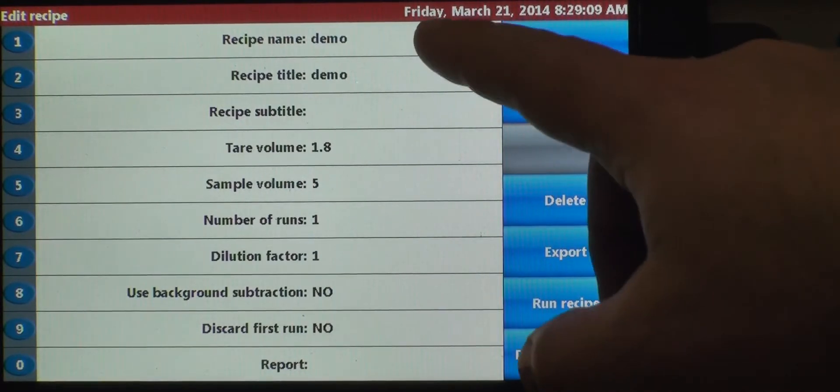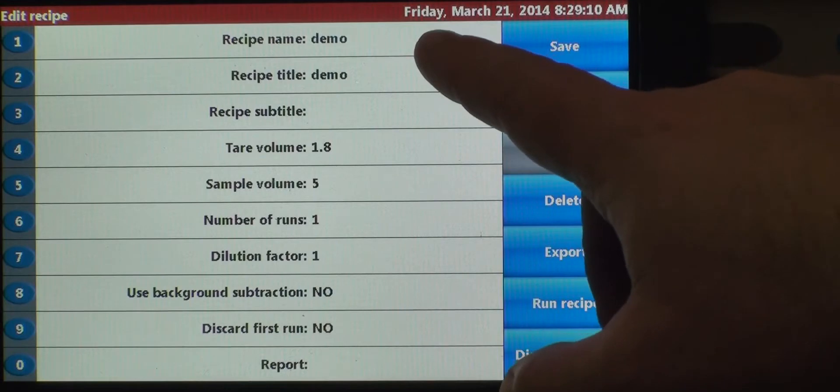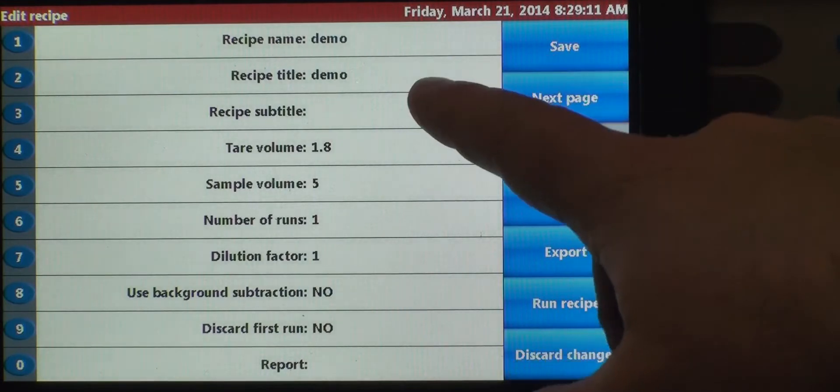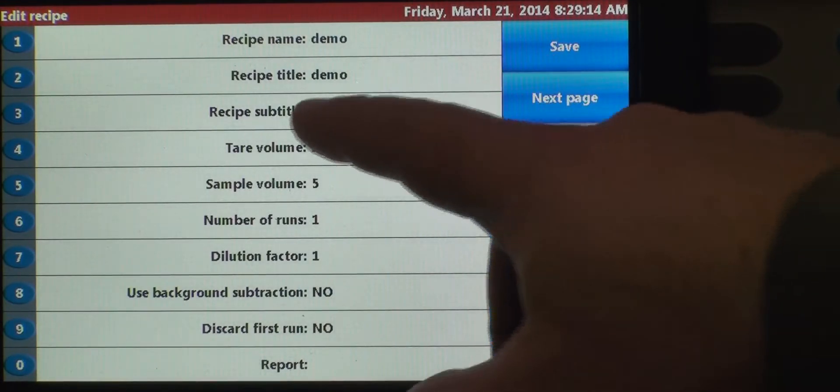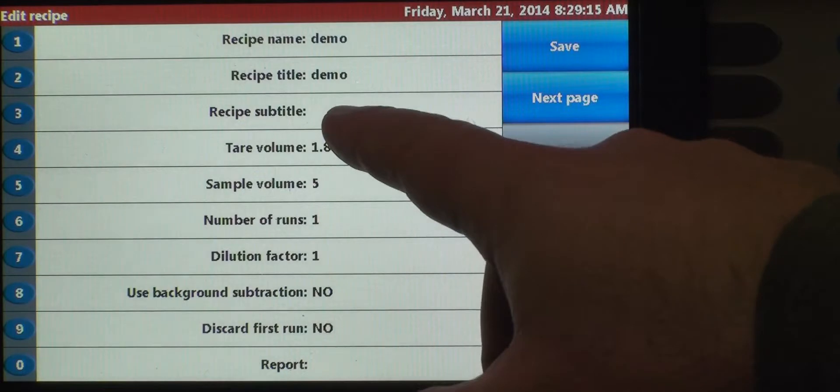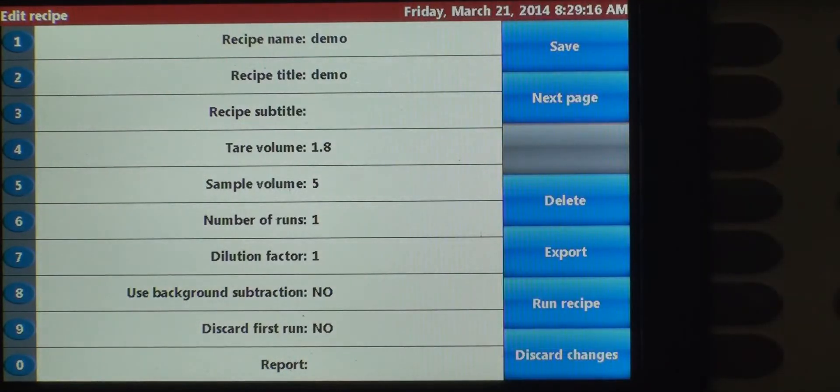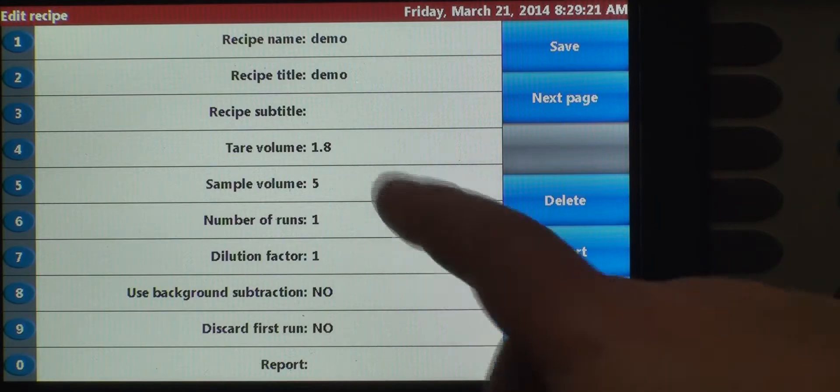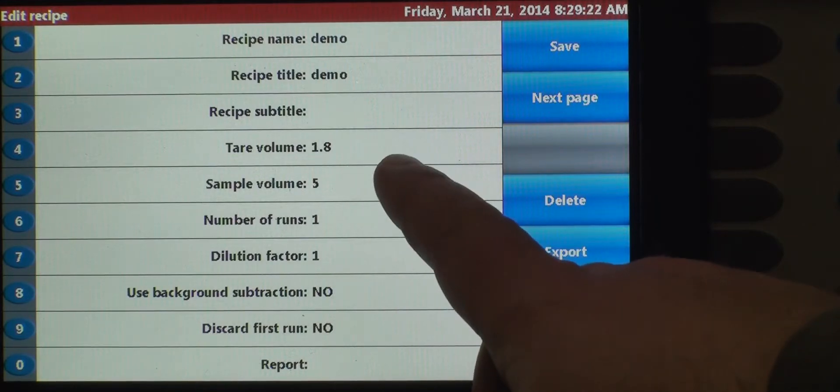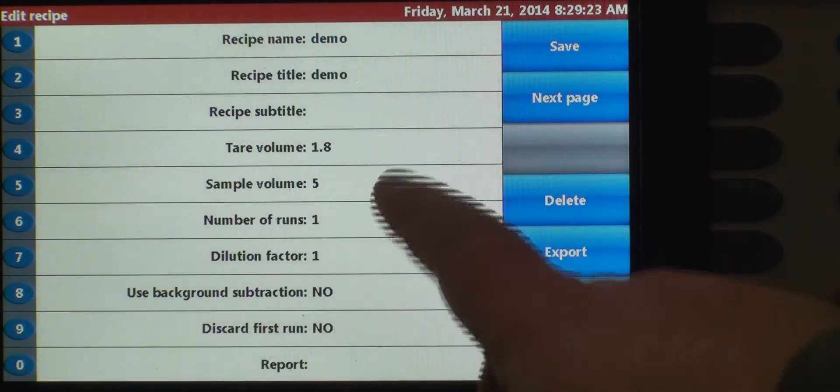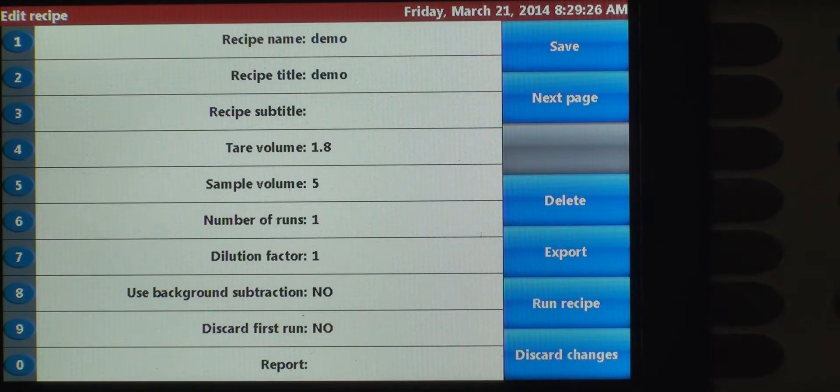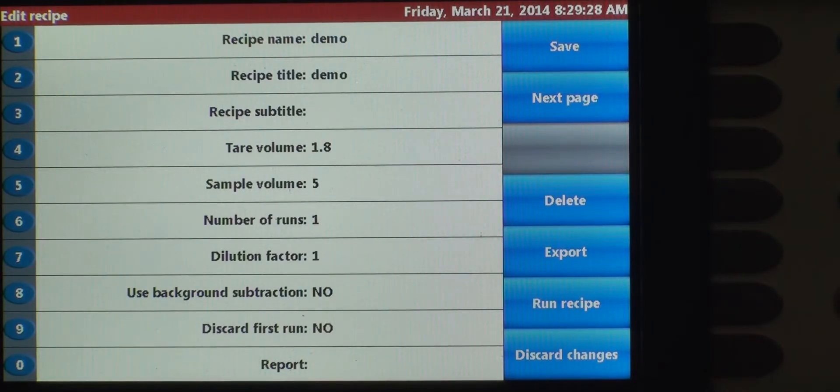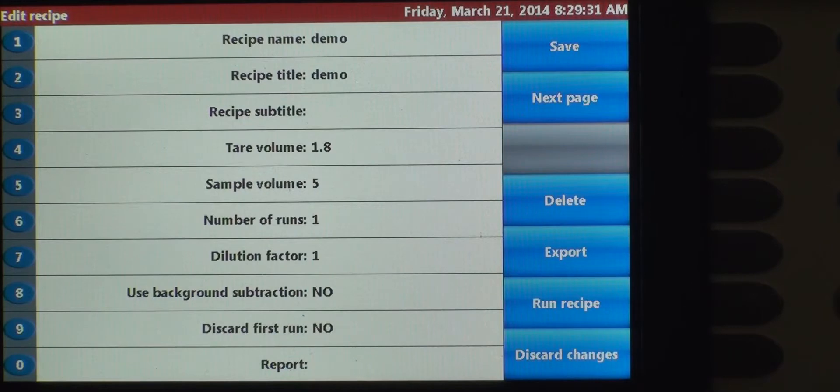So we've created the recipe name as demo. It pre-populates the recipe title as demo. Then you've got a subtitle section. This is for if you want to create a batch ID. The tear volume on the instrument is default set to 1.8 mils. That's the liquid volume between the sample probe and the middle of the sensor.